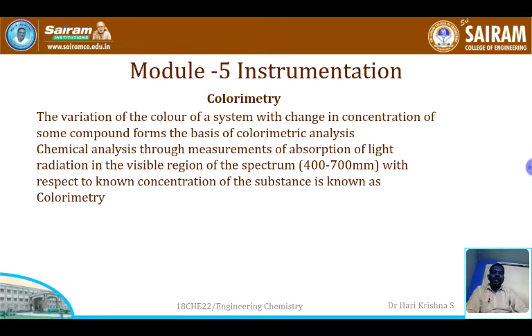What do you understand by colorimetry? Colorimetry means measurement of color. Color is color, metry means measurement. So colorimetry means measurement of color.